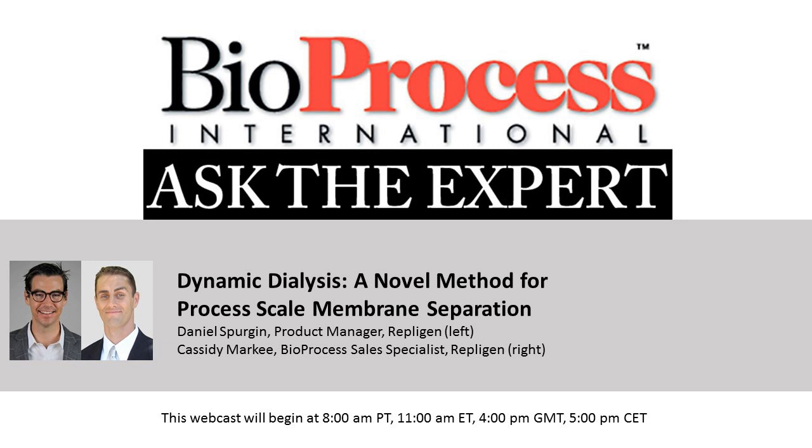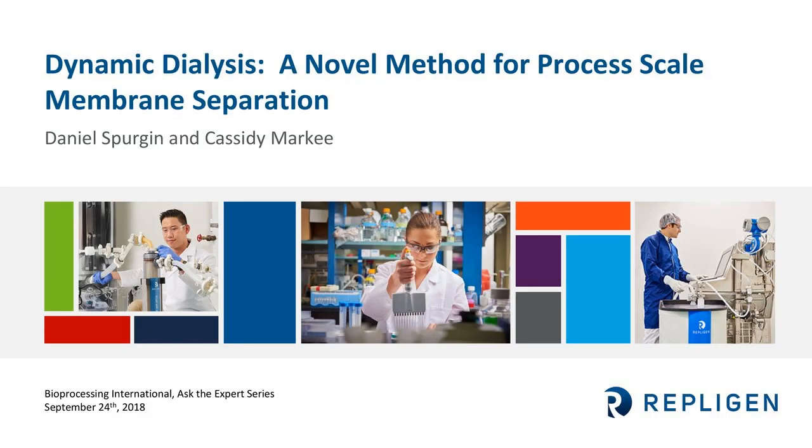We noticed a lot of you are filtration, but we also have some dialysis friends and family, so I'll do my best to show both sides of that coin. So today I'm very excited to talk to you about dynamic dialysis, a novel method for process scale membrane separation.